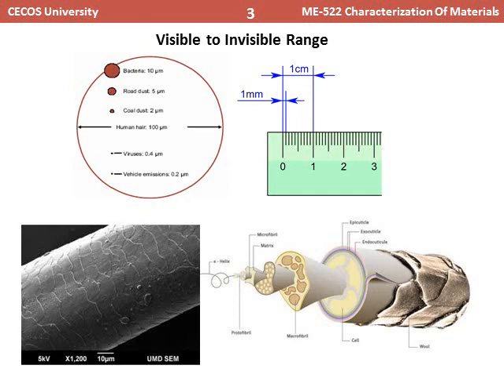So the things that look very simple and naive to the naked eye are not simple. They are complicated structures, and these complicated structures behave differently if we view them by scanning electron microscopy.